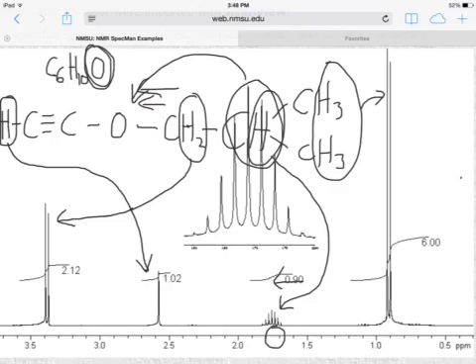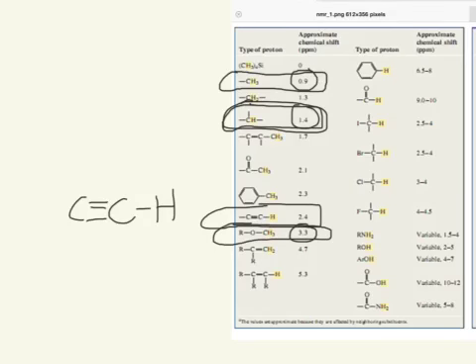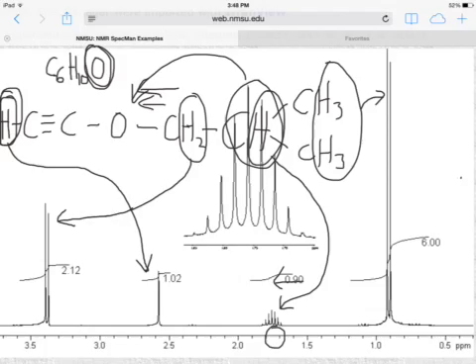And the same thing's going on with our triple bond hydrogen over here. The table says we'd expect to see it at about 2.4, and we see it a little more downfield at about 2.6. And again, that's because this hydrogen is somewhat close to this oxygen, which is pulling electrons in inductively and pulling the signal a little bit more downfield than it otherwise would have been.